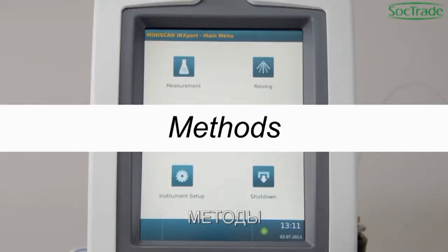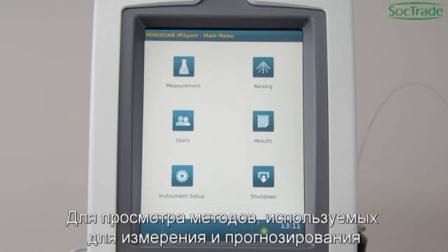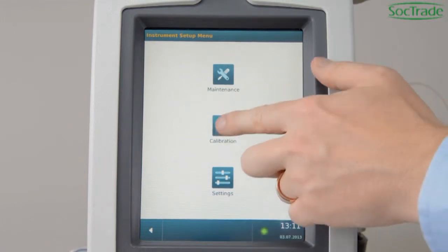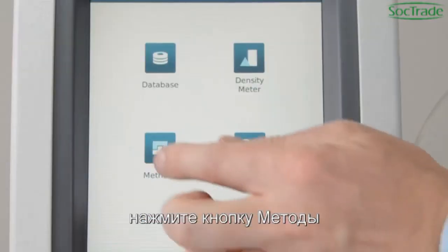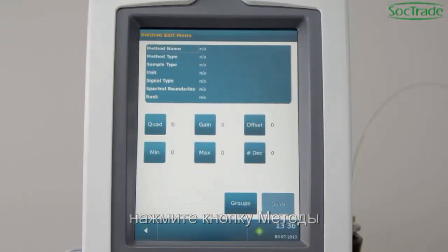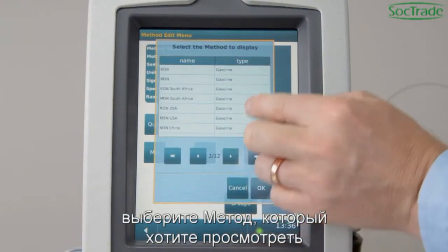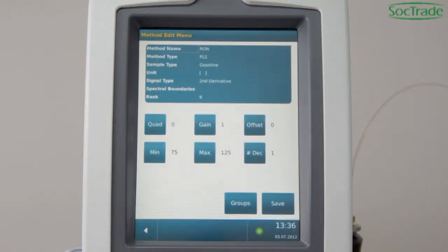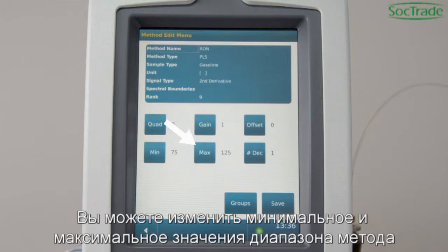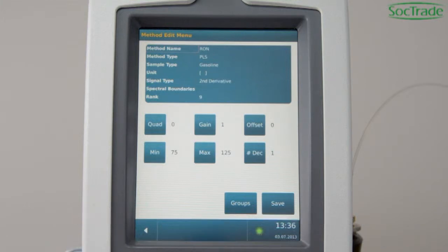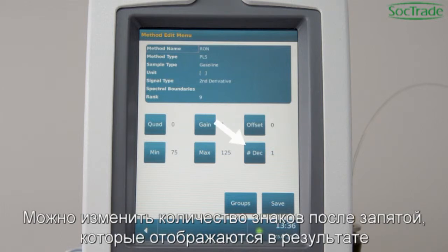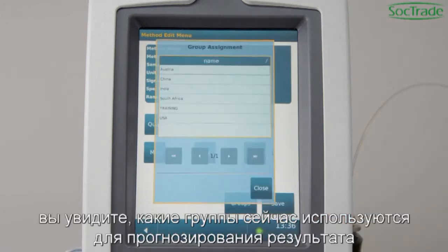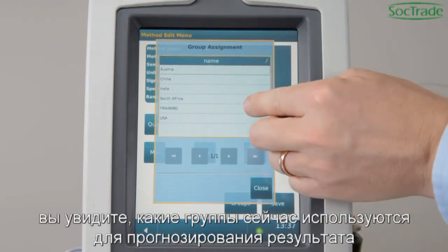Methods. To review the methods used for measurement and prediction, go to Setup and enter Calibration. Click on Methods and select the method you want to review. All information about the specific method is listed here. You can change the minimum and maximum limit for this method, and the number of decimals shown in the result. If you go to Groups, you will see which fuel groups are currently used for prediction.